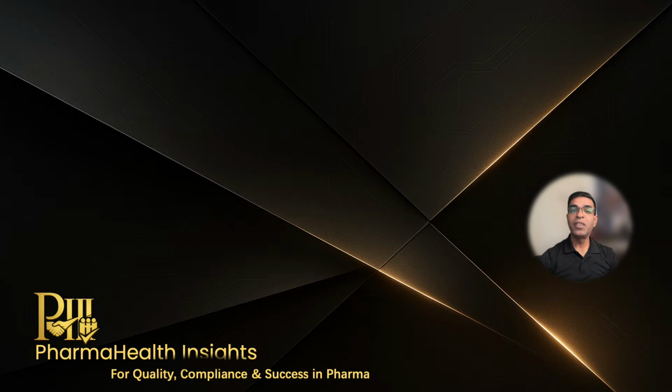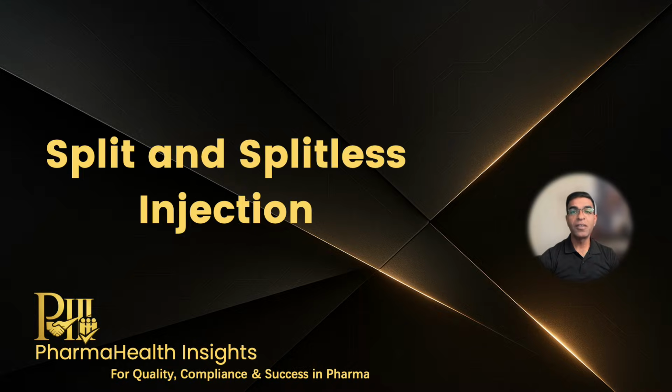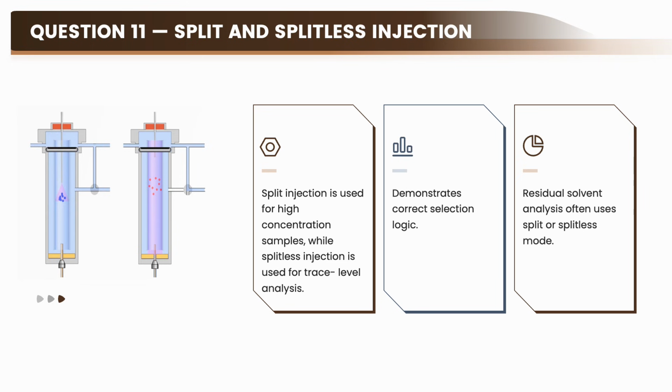So once you talk about the injection system, now the interviewer will naturally ask about the injection modes. What is split and splitless injection? You should answer like this.